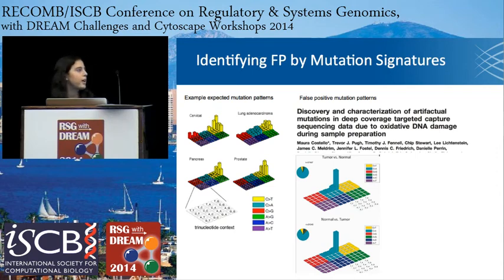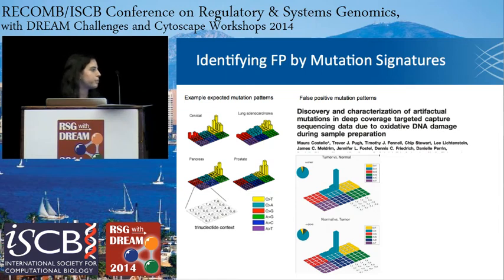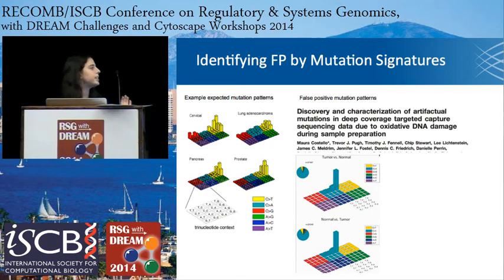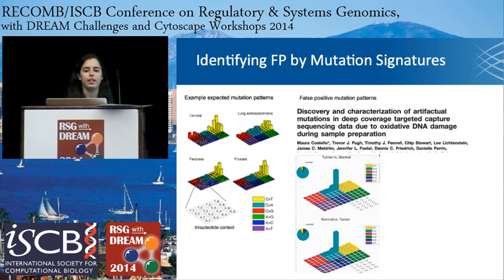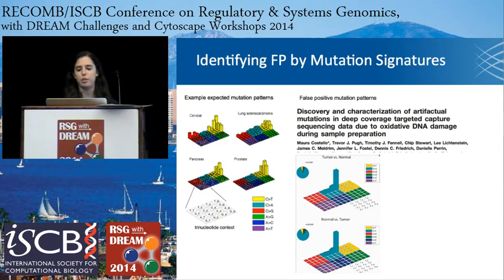We used this method previously and identified what we call the OXOG artifact, where oxidative DNA damage during sample preparation produces a signature dominated by C-to-A mutations in a specific context, overwhelming all other possible signatures. So either this could be an exciting scientific discovery — or it's an artifact in our data. Being somewhat cynical, I usually go with the latter. By identifying this signature, you can then dig into those mutations and filter them out appropriately.